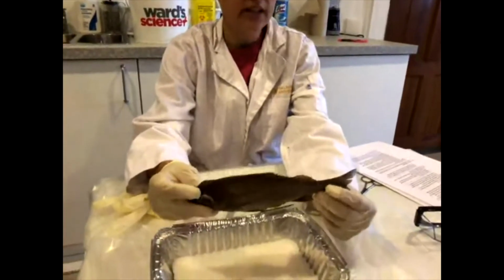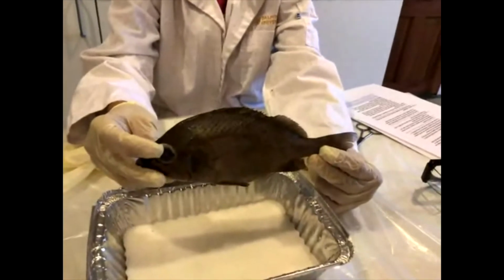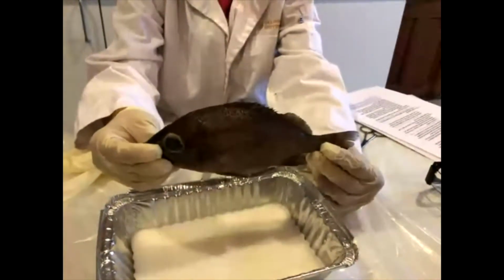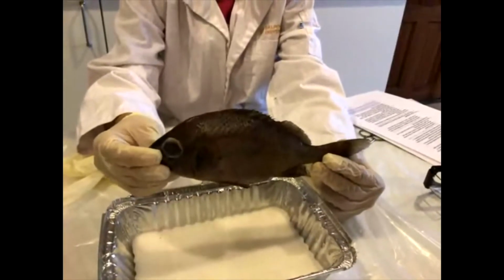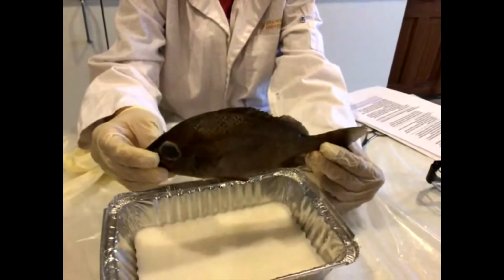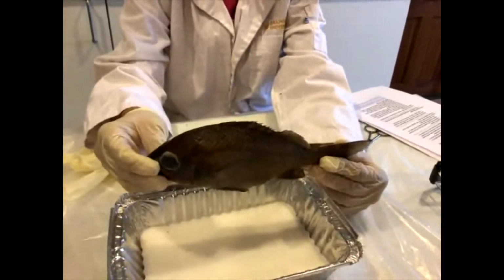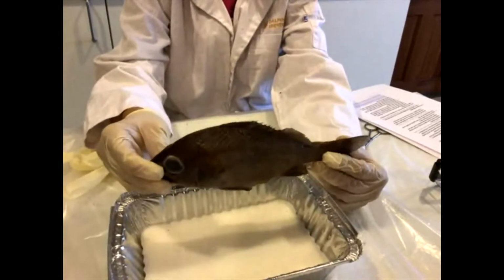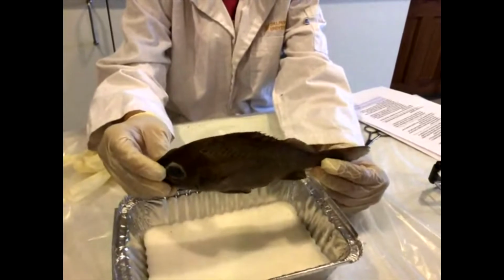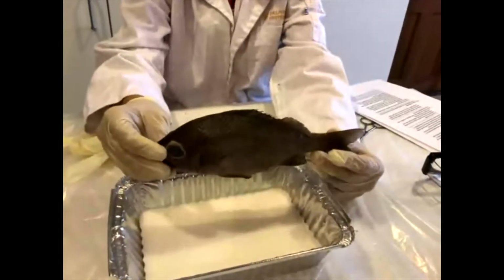It's important that even though we are going to cut into this animal and investigate it, we want to be respectful. This animal was once living, as all animals on this planet are, and we want to be able to respect that life. So as much as it may be interesting to dissect your own animals, I think it's really good to do it in a lab setting, because there's some safety concerns, and you also want to make sure that it's done with animals that are meant to be dissected, and so that doesn't mean taking anything from the wild.